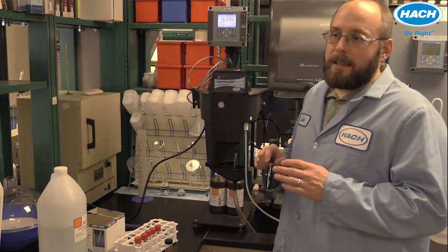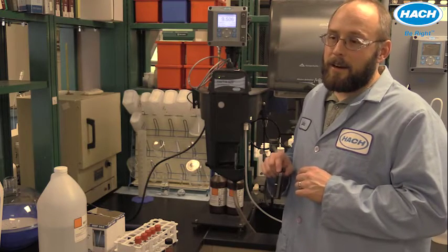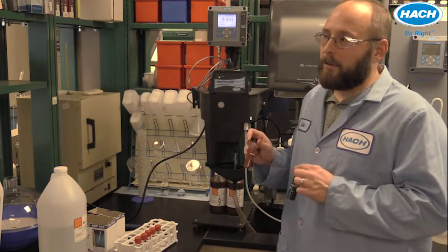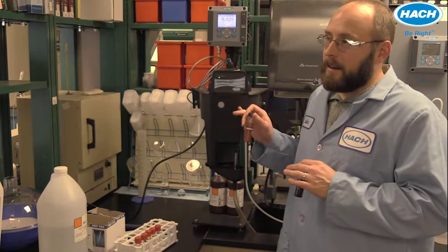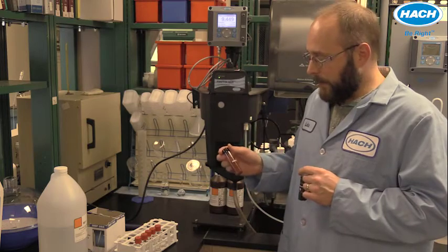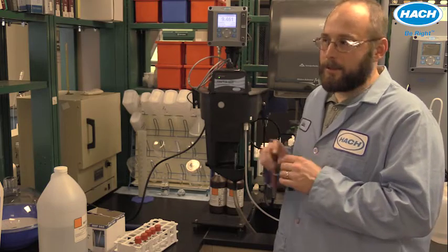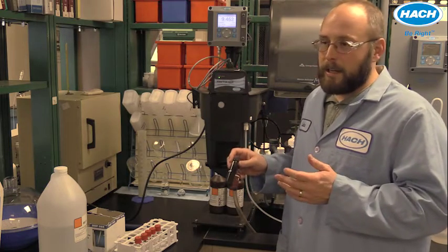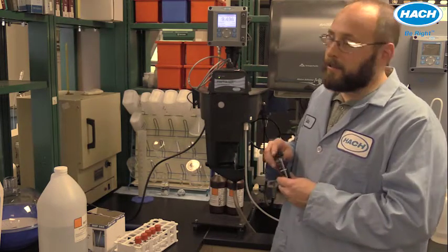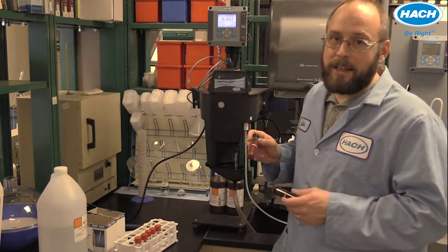In the steam cycle, we make the assumption that the overwhelming majority of particulates present are iron oxides, but we have to go one step further and perform an on-site calibration because a nephelometer will respond differently to different colors and different sizes of particles. For instance, the red hematite will reflect more light than the black magnetite, which will absorb more light, which means that for an equal concentration of iron, if it were present as magnetite, you would get a lower nephelometric response, indicated up here on your controller, than you would for the same concentration of iron if it were present as hematite.